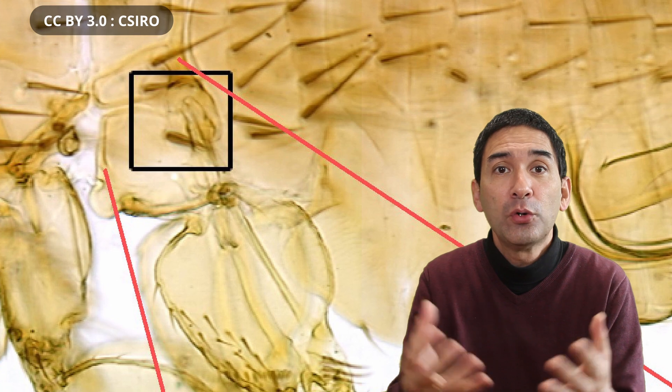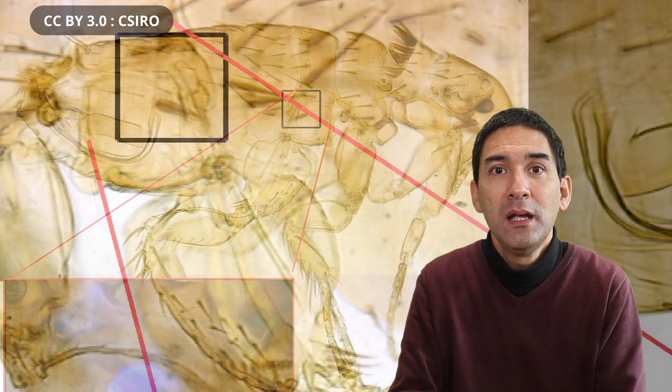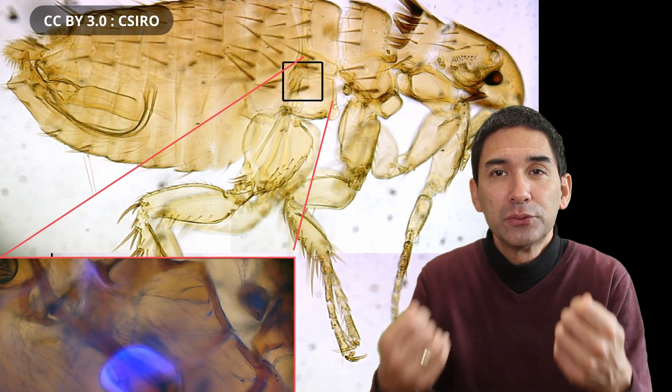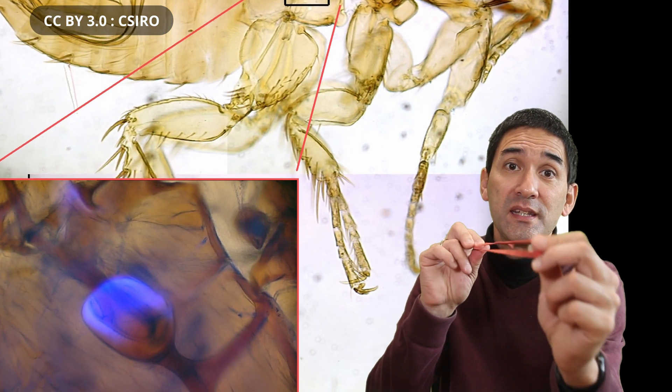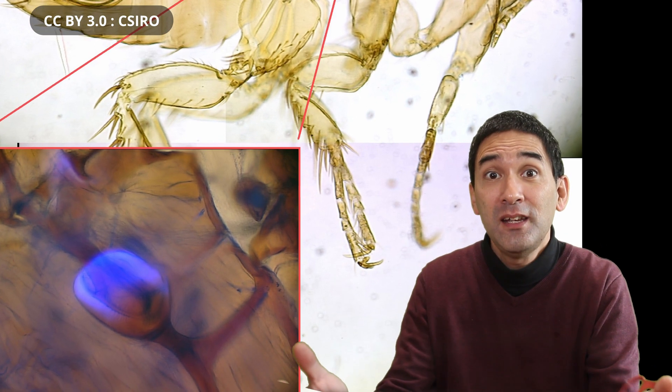This organ contains a protein called Resilin, hence the name, and it's a very elastic protein that works like a rubber band. So the muscles stretch the organ and when it snaps back then the flea jumps off.